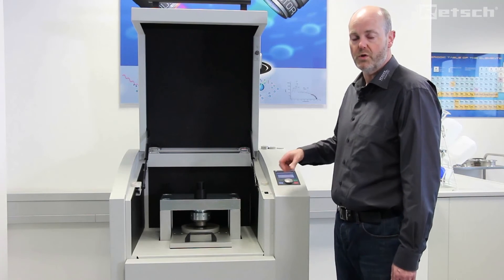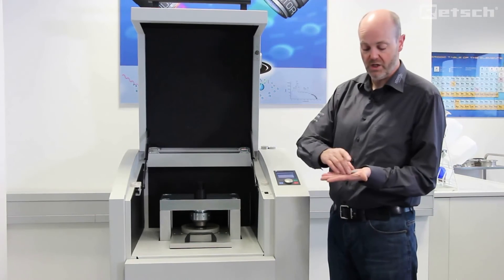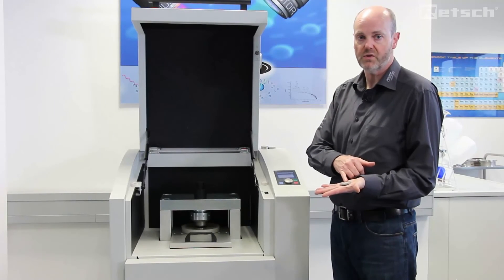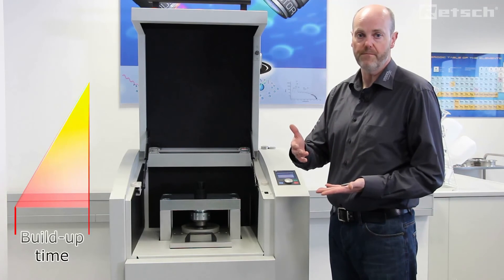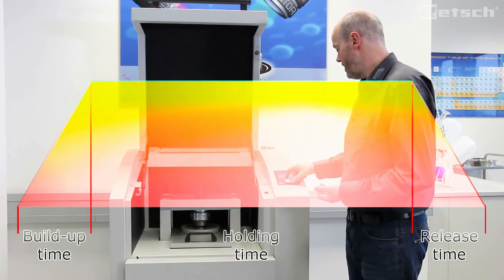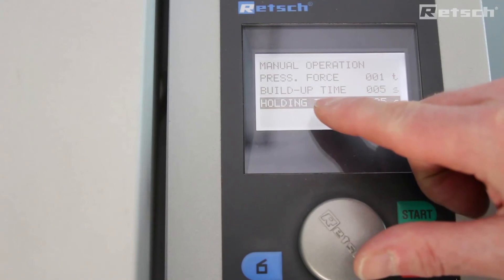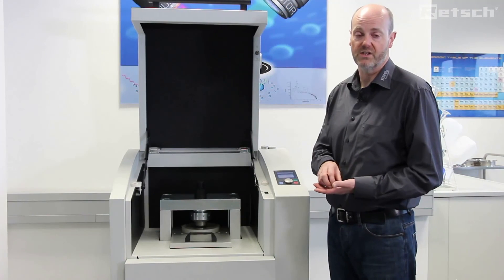Furthermore, to ensure that we have a really homogenous and flat pellet without any cracking, it is important that three parameters are observed: the build-up time, the hold or dwell time, and the release time. Each of these has their own parameter setting and can be controlled digitally from a minimum of five seconds up to a maximum of 600 seconds each.